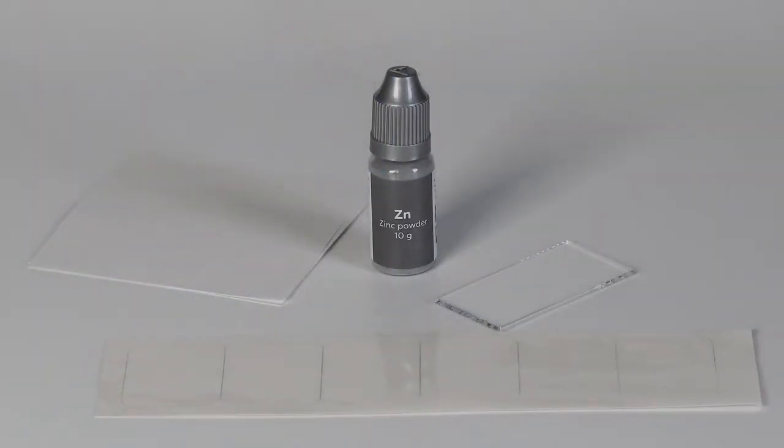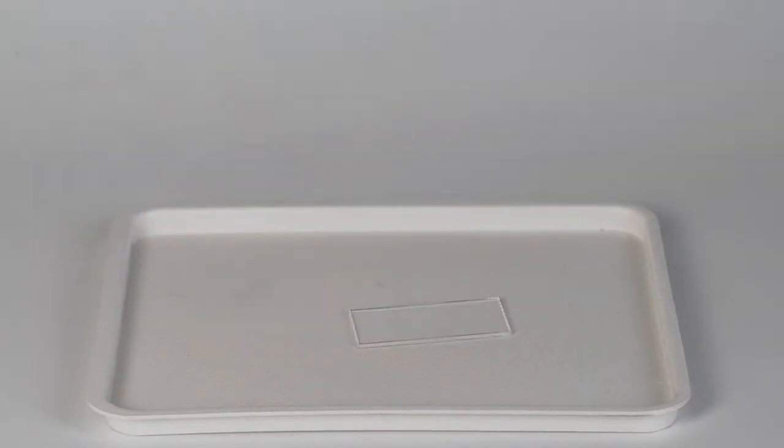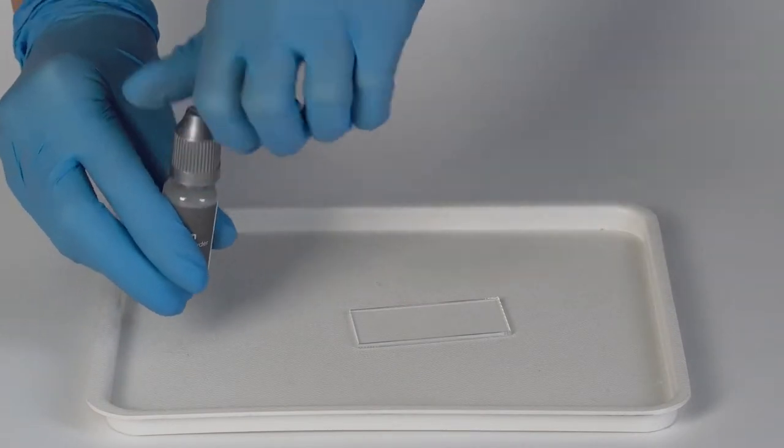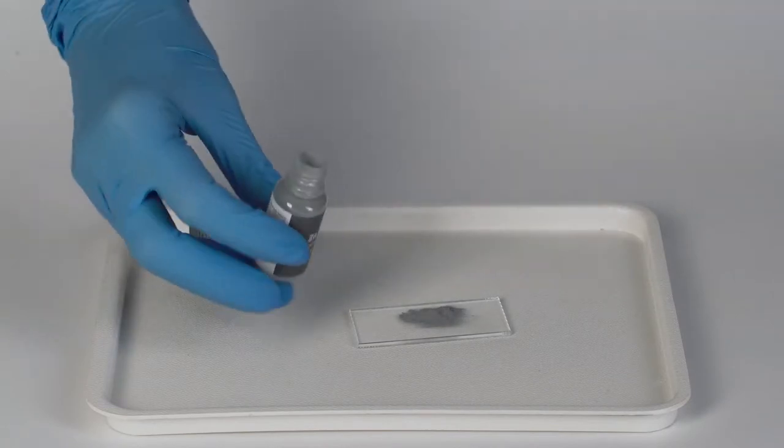Take the glass slide and make a fingerprint on it. Then put on the protective gloves. Carefully pour some of the zinc powder onto the spot where the fingerprint is.